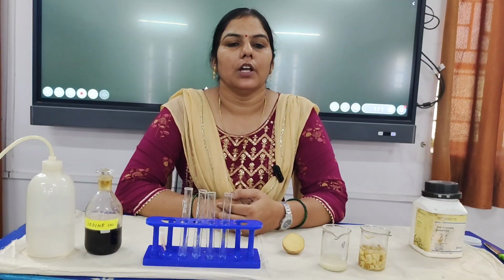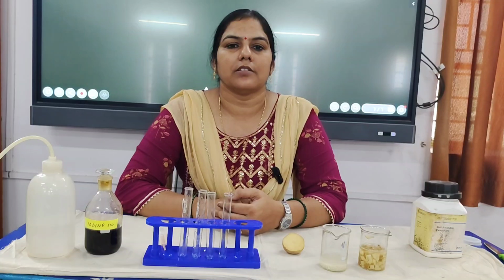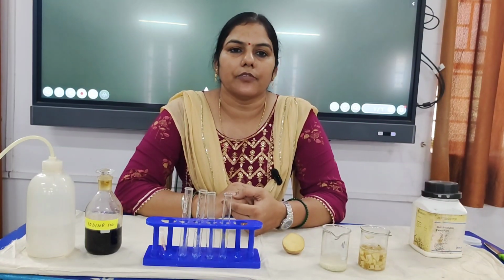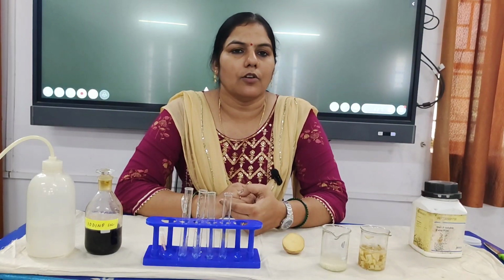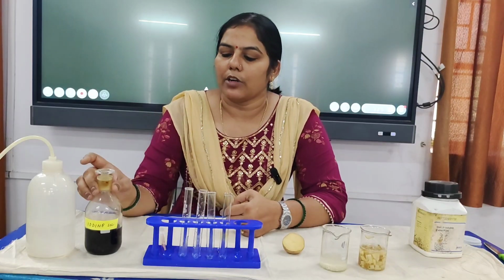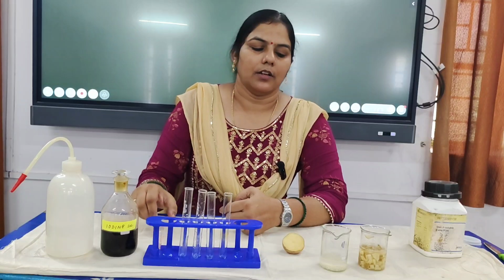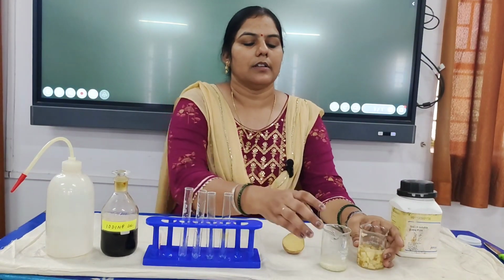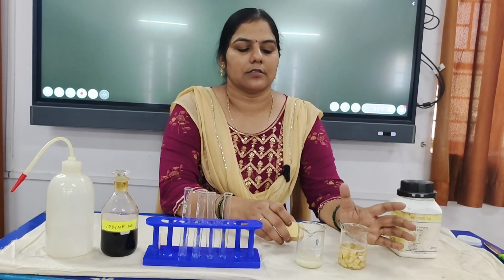In today's video, we will be performing an activity regarding the presence of starch in various food samples. For detecting the presence of starch in the food sample, we will perform the iodine test. For this activity, we will need test tubes, iodine solution, water, a dropper, starch solution for a positive test, and our food samples, which we are testing for starch.